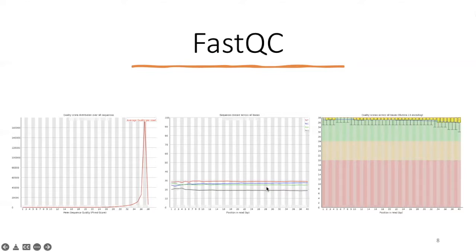So you will never get such clean results, basically, because I guess those were generated at the very beginning of Illumina sequencing. You can see that the reads are very short. They're at most 40 base pairs long. This used to be standard for Illumina sequencers, that you would not sequence very long, but now it's becoming more common that you would have 150 or 100 base reads, and you can even go up to 300 or 600 bases in your sequencing. Therefore, the quality will suffer.